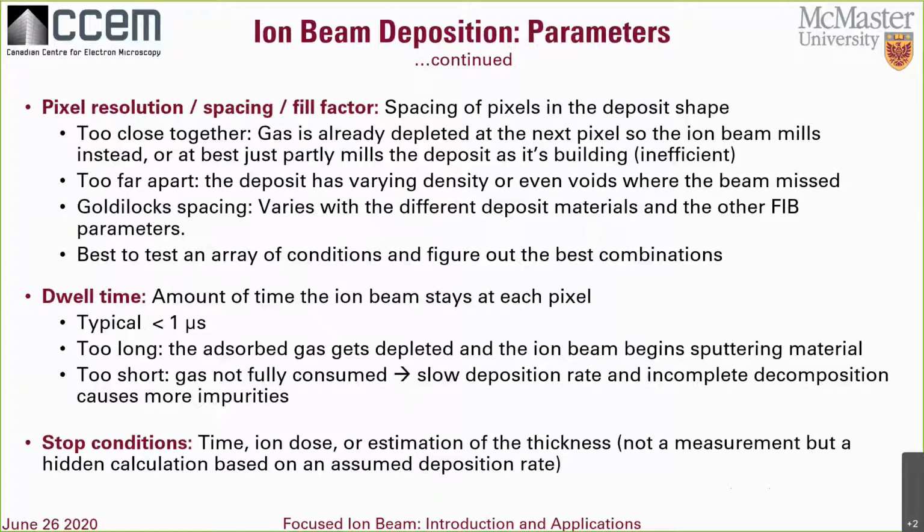Okay. What is the thickness of the sample when you start the 10 kV cleaning? Yeah, that's a good question. It's going to depend on the needs of the sample, and it also depends on the material.